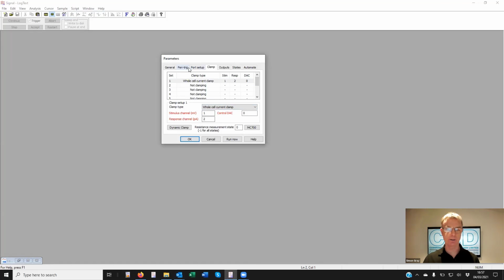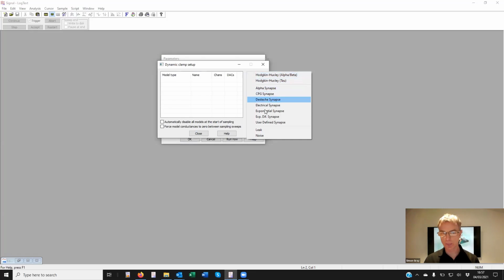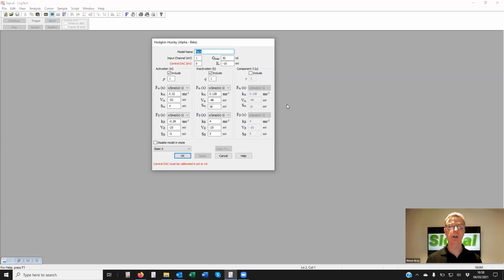I have to set my DACs up. If you set the right correct scaling on the DACs and the inputs, you could then go in and create models, which are conductance models. Models will read the voltage of the cell membranes during a current clamp experiment, and inject current. That is, having read the voltage, it will know how much current to inject, given a particular formula for that.